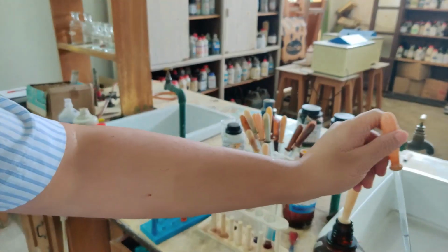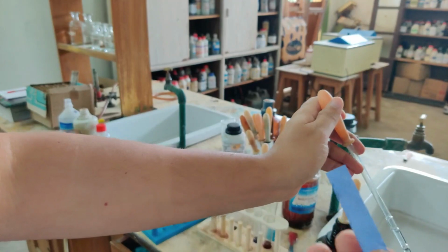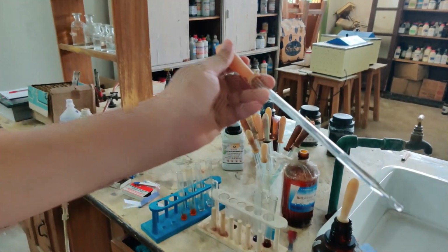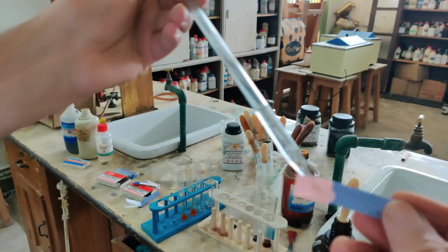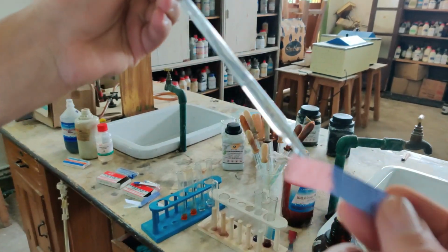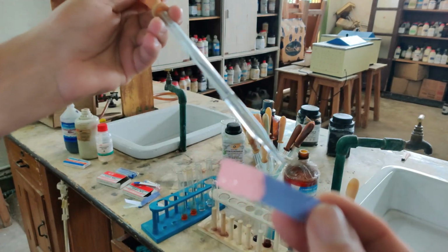Here I am taking the same acid now, dilute hydrochloric acid. Now notice what change in color is seen with this litmus. See, I am adding this. So you can see that the color of the litmus has turned to red. So blue litmus turns red.